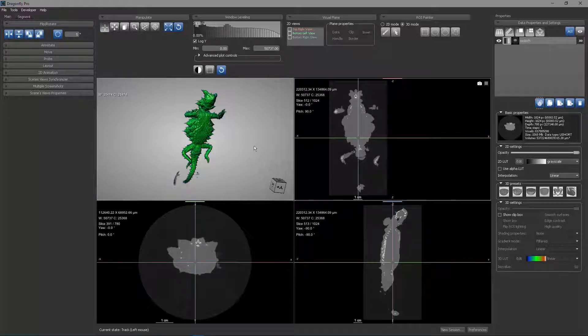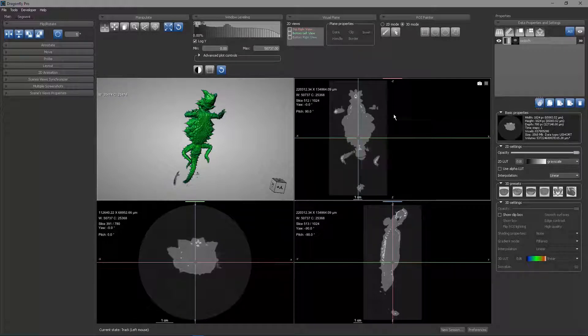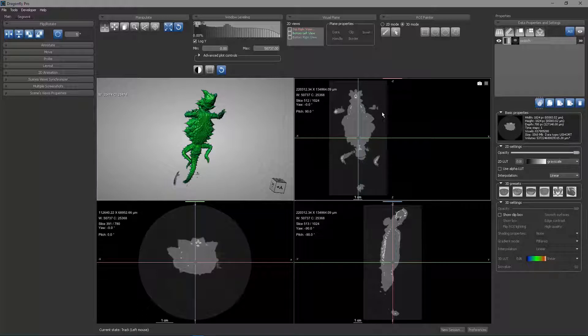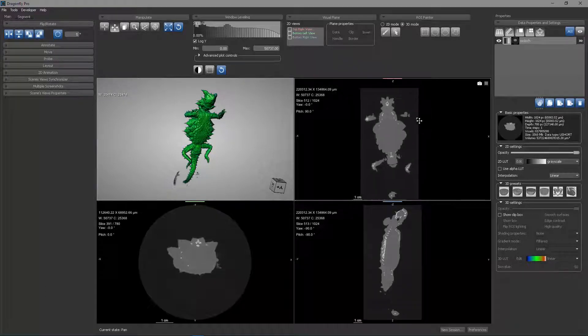If I go back to the track state, you can see that for me to do a temporary pan, and again, you can watch the state indicator at the bottom, I can enter the temporary pan by holding down the left and right mouse buttons simultaneously that allows me to pan.